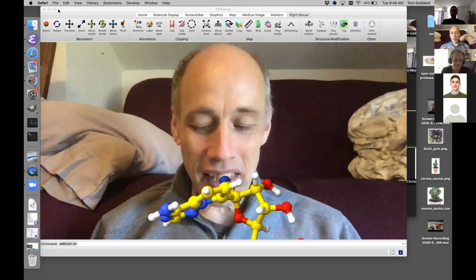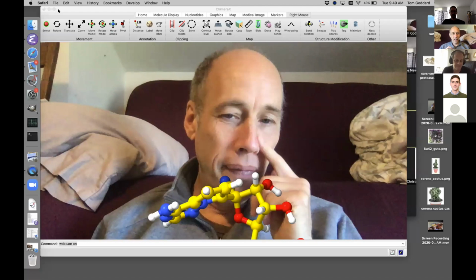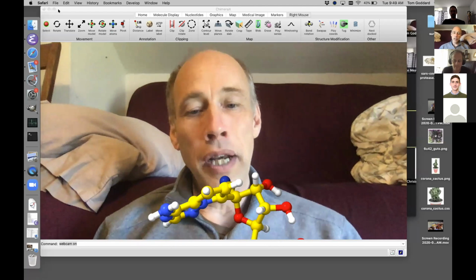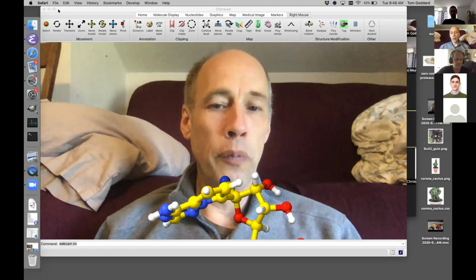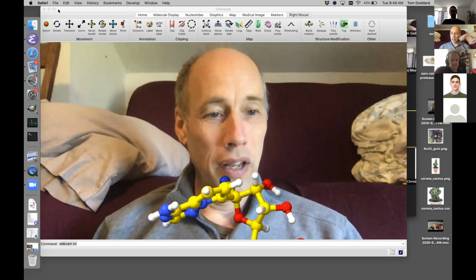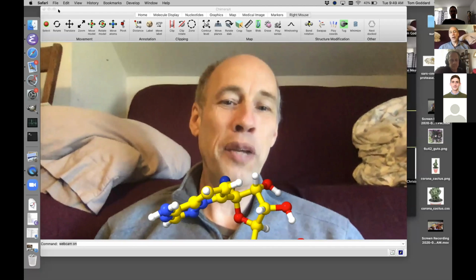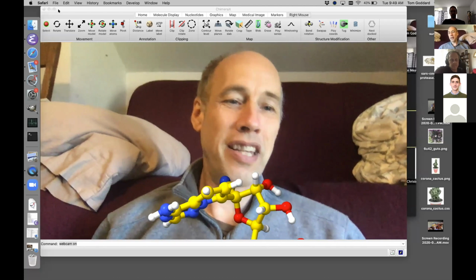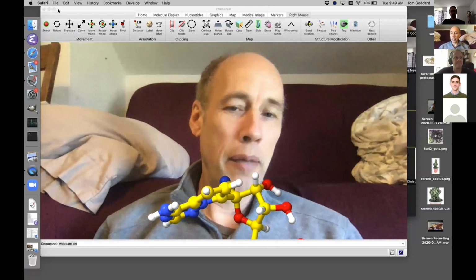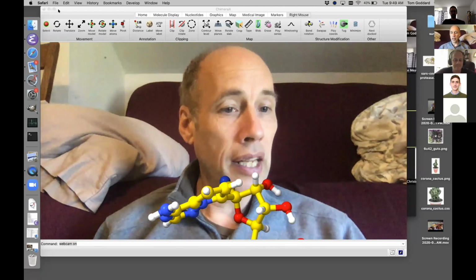I was curious whether it would work, because audio-visual on Linux has historically been problematic. ChimeraX is based on the Qt window toolkit, and Qt handles video. So I just asked Qt, is there any webcam? Oh, there is. Give me the video from it. So I believe Qt can handle the video on Linux. I saw lots of posts about that online when I was working on the code on Sunday.